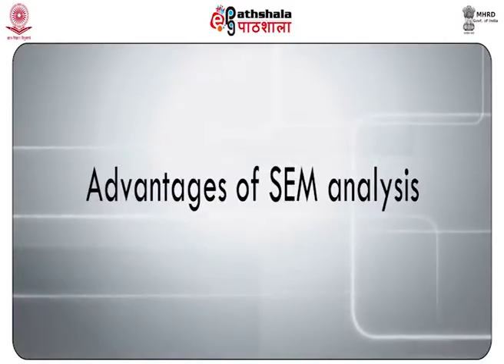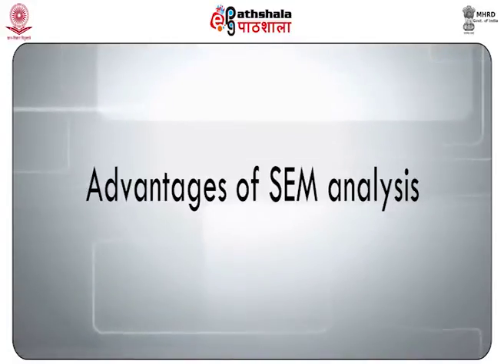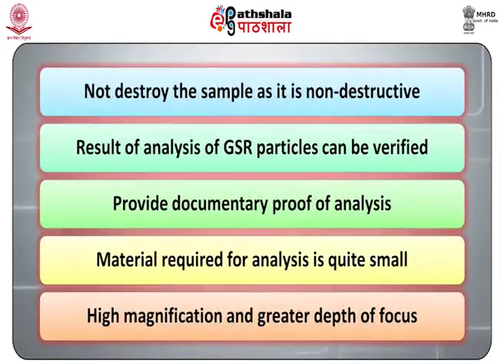Now, let me tell you something about the advantages of SEM analysis. Analysis of GSR particles by SEM is beyond doubt the best method because of several reasons. Number 1, it does not destroy the sample as it is non-destructive. Number 2, the result of analysis of GSR particles can be verified if required at any time.